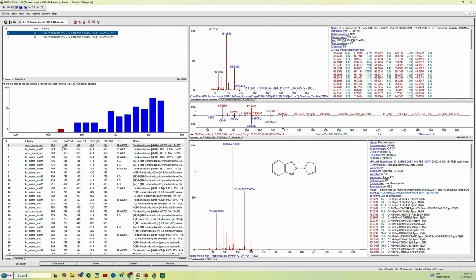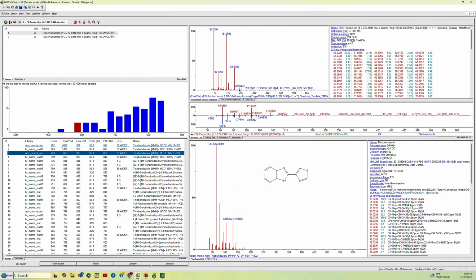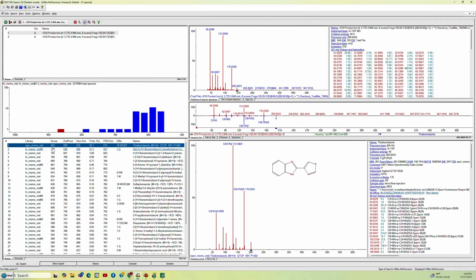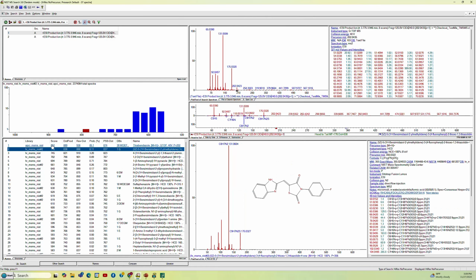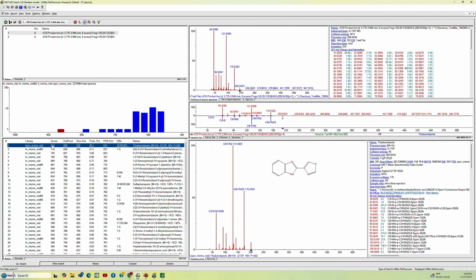And we got the same results for that. It just matched the pattern and they're very good. It did find some different things further down. Let's turn on our best matching only. So it has the best hit, that's the correct one. And then the next one down is a little different, aromatics. But indeed, you can see the score is falling from 862 to 776.